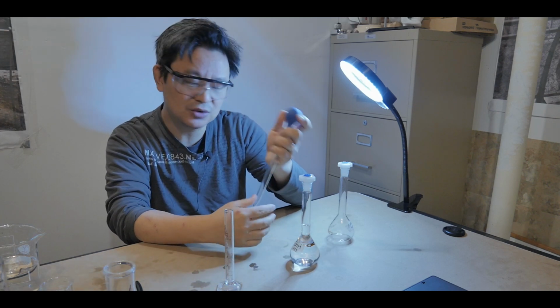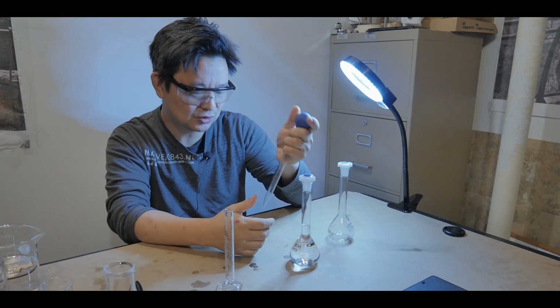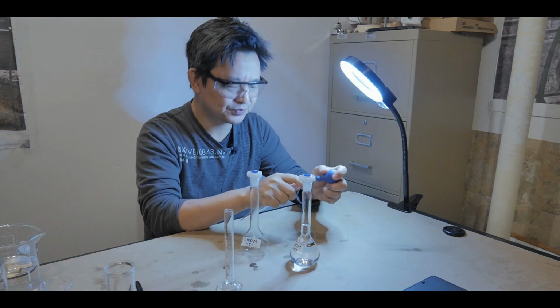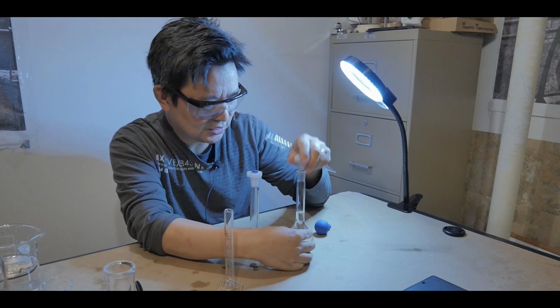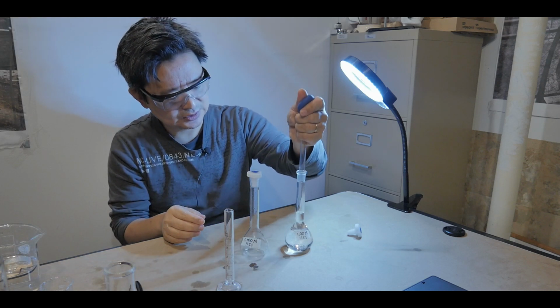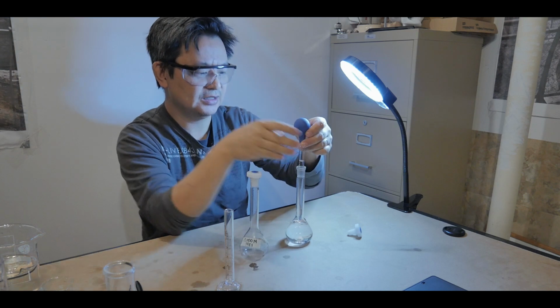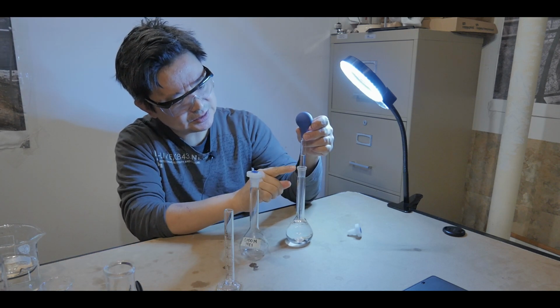Now it's a bit tricky when using a pipette because you have this plastic bulb. You're trying to suck the solution in there. Okay, let me show you right now. Like I said, it's a bit tricky. So we have 1 molar concentration, and then we're going to suck out 10 mils. There we go. Okay, so it's able to pull above the 10 mils, which is good.